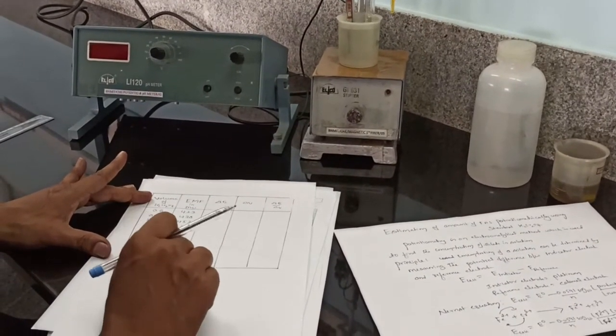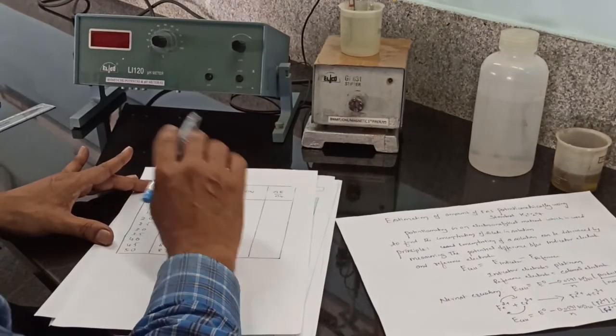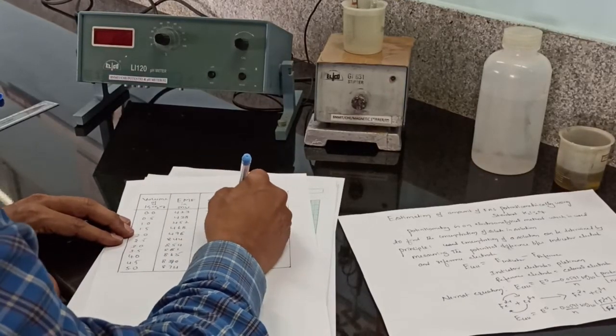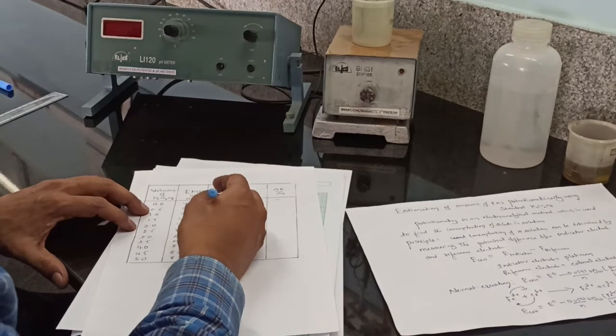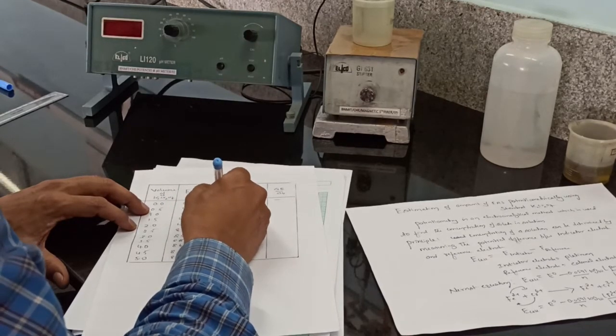For derivative graph, we have to find the values for change in EMF and change in volume. There is no change in EMF or difference of EMF for 0, similarly for delta V. At 0.5, the change in EMF, the difference of EMF, is 438 minus 423.